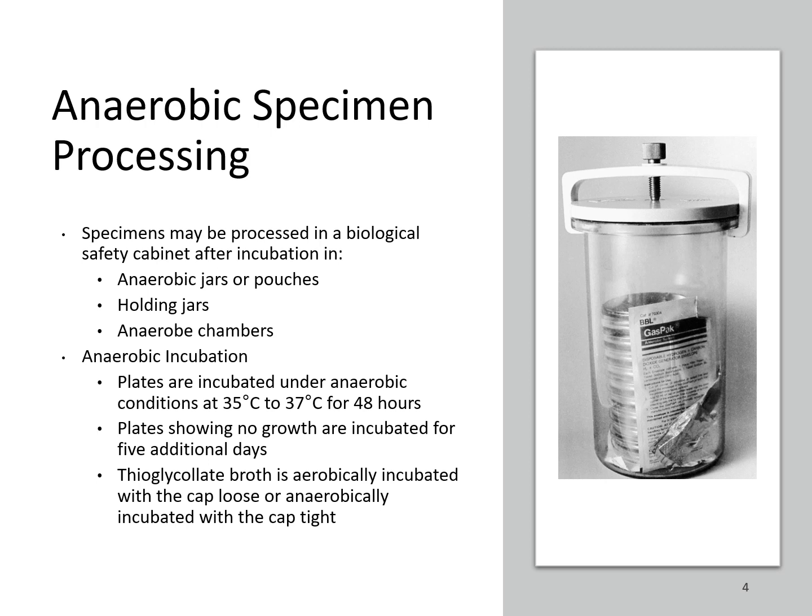Once it's put into that broth, you'll have two broths, and one will be capped very tight to keep that anaerobic environment, and one will be put on loosely so that it'll allow the presence of oxygen, so that if there are aerobic organisms as well as the anaerobic, then you have the ability to detect those organisms as well.